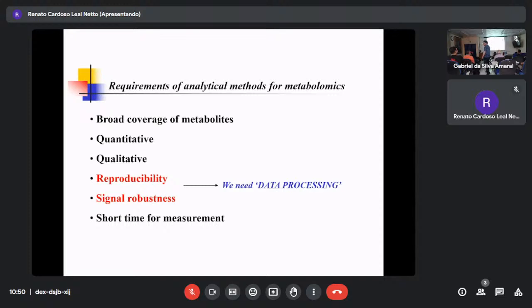But when you do some HPLC UV spectrum, it is not really qualitative. Based on UV, you don't know the structure, except for some compounds. That's not qualitative. Then, in that case, this qualitative is maybe not necessary for fingerprinting. I'm not interested to identify the compound. I'm interested whether it's the same or not. But for the metabolic profile, we need it to be qualitative. Is this clear?